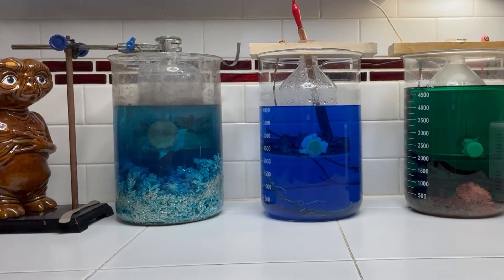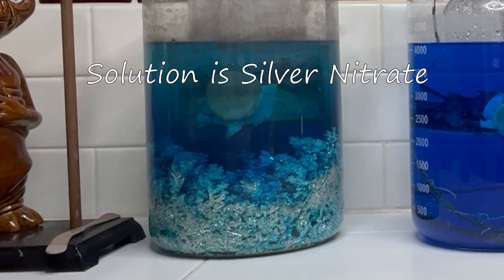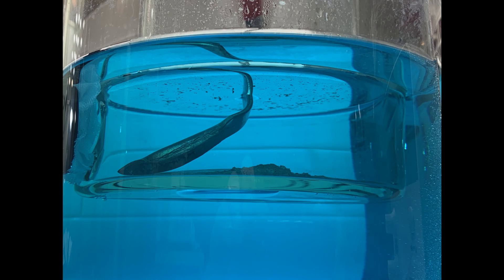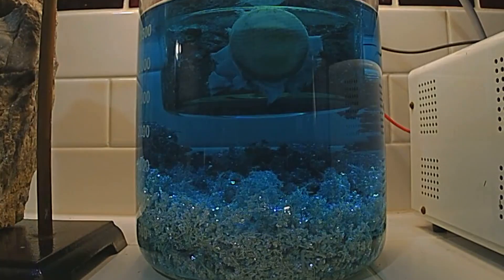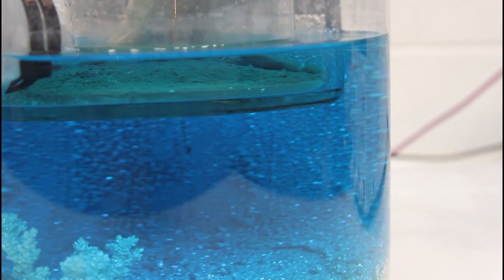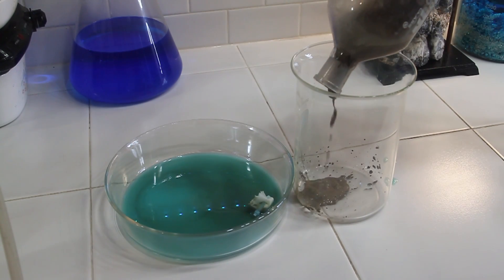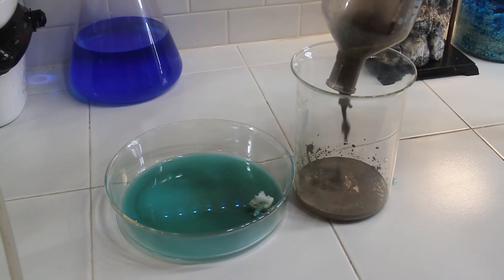Our third cell is our number two silver cell and it works the same way as the copper cell, except we put 925 silver or higher silver pieces in the anode bottle and pure silver is plated out on a stainless steel cathode. Any metal richer than the silver, like palladium or iridium, will get captured in the anode bottle, while base metals like copper and zinc are turned soluble and remain in the silver nitrate solution. You can also melt the slimes from the copper cells and then put those into the silver cell to get your pure silver back out.